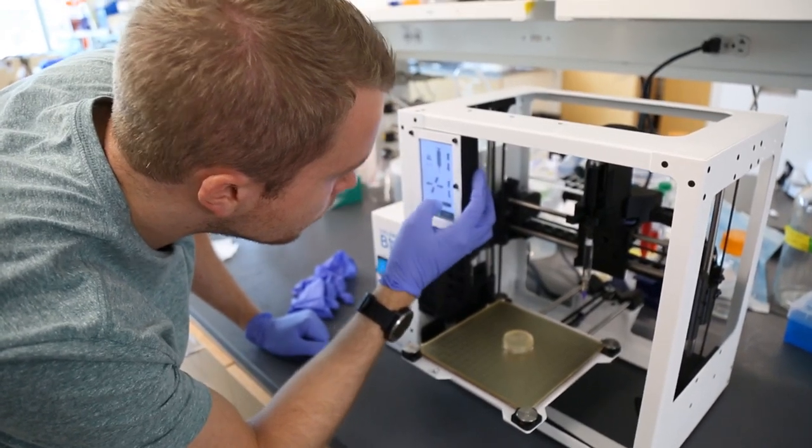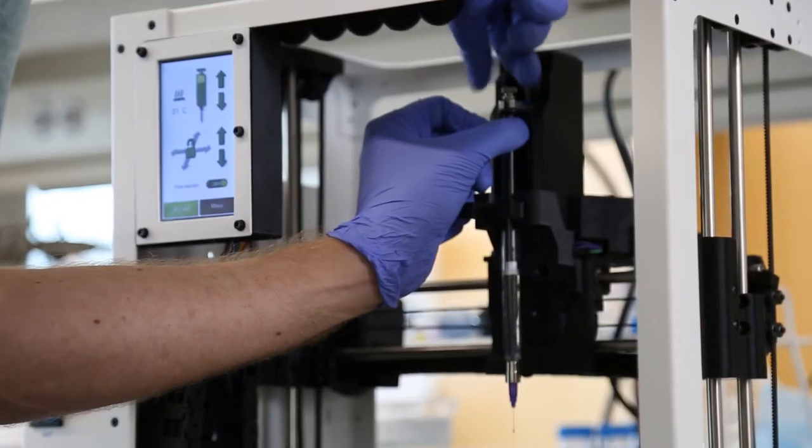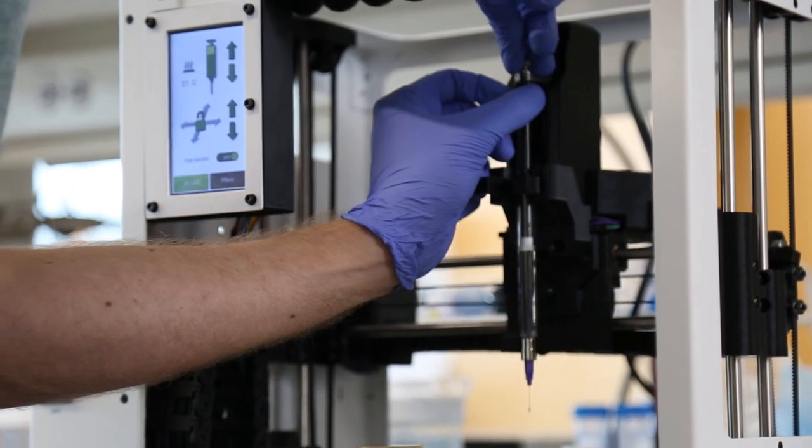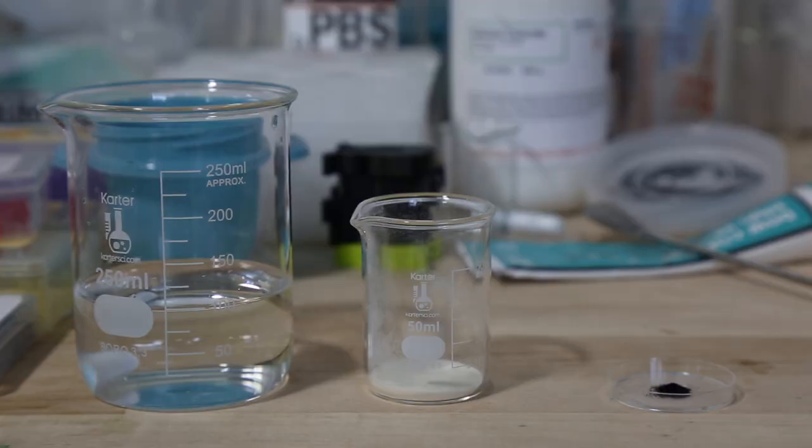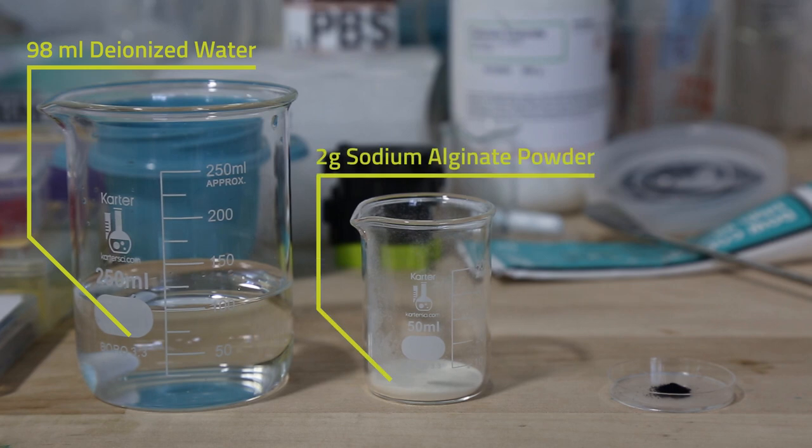Today we're gonna mix 100 milliliters of sodium alginate to print out of the LulzBot bio and then we're gonna load that into the syringe pump. We need 98 milliliters of deionized water, 2 grams of sodium alginate powder, and 0.02 grams of Alcyon blue dye.